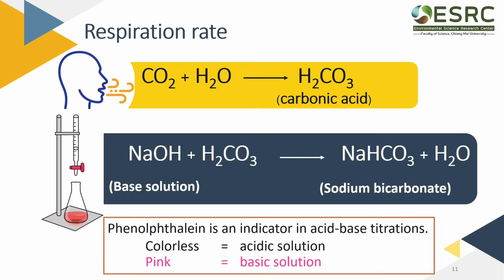These are the principles of this experiment. The carbon dioxide from our breath will dissolve in the water and become carbonic acid, like this equation. Titration with a base solution, sodium hydroxide, reacts with carbonic acid to form sodium bicarbonate, which is an alkali salt.